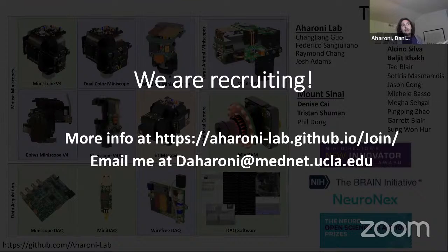Also, the 24-hour recordings we've done are just using GCaMP6 fast. So just going to 8 slow or 8 something will give you a fourfold improvement in recording length. There's also RCaMP, which we've imaged before. All calcium indicators are dimmer than GCaMP, but RCaMP you can generally see nicely as well.